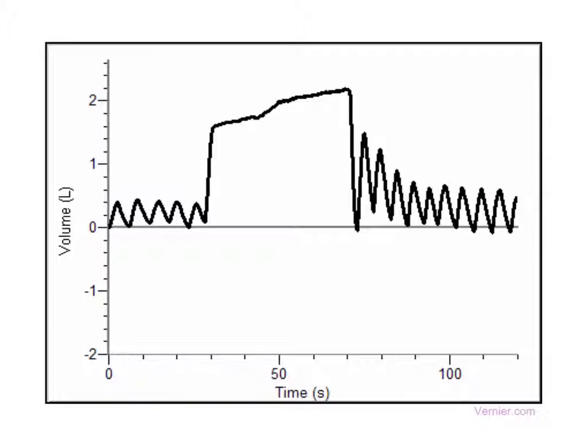One thing I should point out is that your graph is not going to look like this exactly when you first collect your data. You might have to tap on the axis on the labcast to change this one to volume. And it should have time on the x-axis, but if not, then you just tap on the bottom to change the axis.